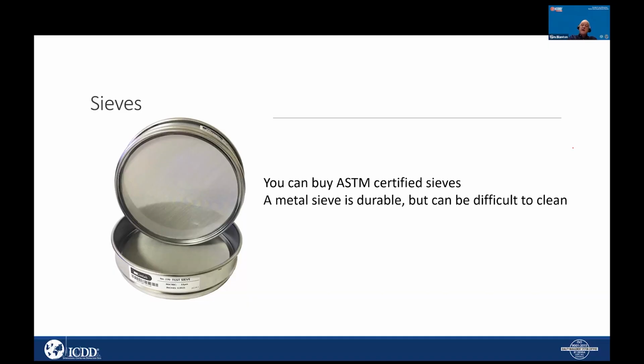And by the way, you would want to get those made out of stainless steel. They do make them out of brass. The problem with those is that if they get washed and the water isn't dried away properly, you'll get corrosion of the brass. It'll make copper oxides, which will then give you some contamination. So stainless steel is best.